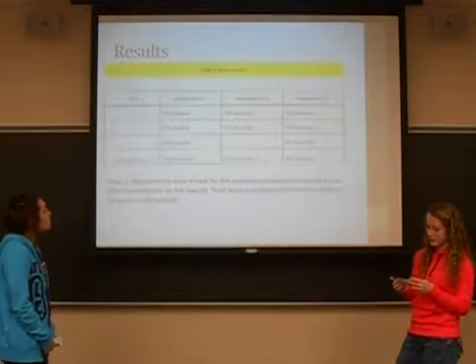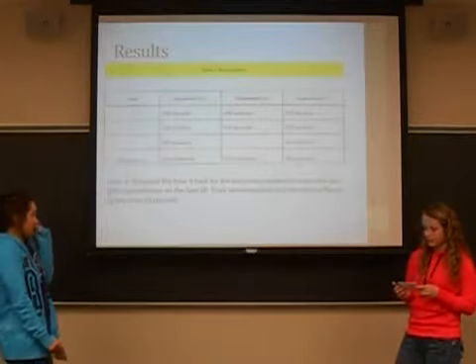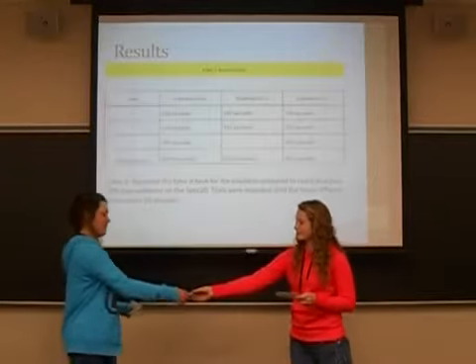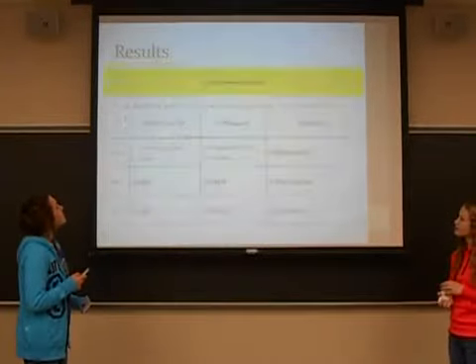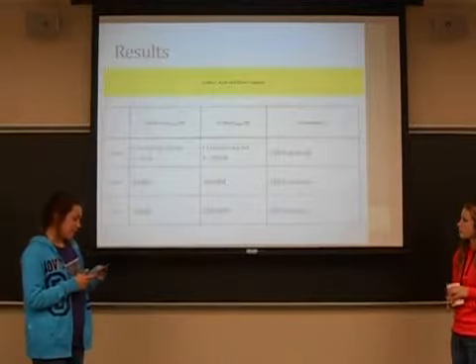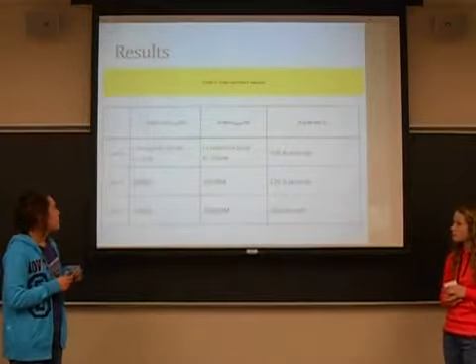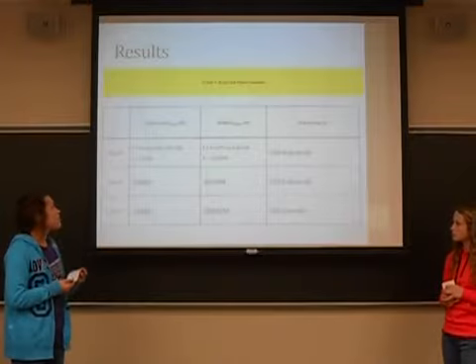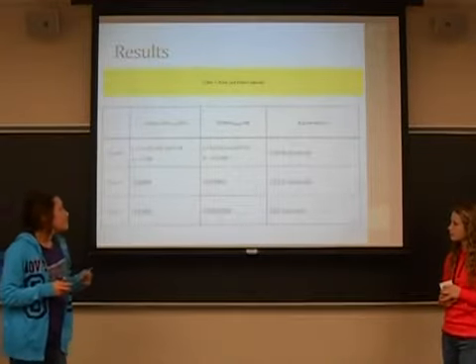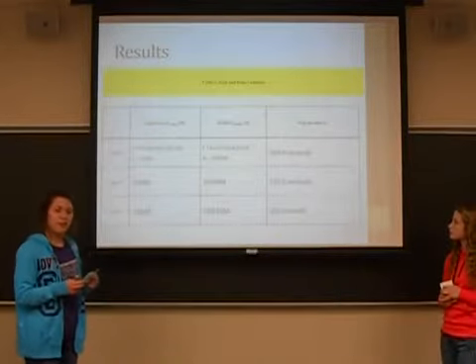This is table 2, which was our reaction time. It recorded the time it took for the solutions prepared to reach and pass 30% on the Spec 20. The trials were repeated until the times differed by less than 10 seconds. This is table 3, the rate and rate constant. To find the molarity of the oxalic acid and the KMnO4, we use the equation M1 times V1 equals M2 times V2. So for experiment 1, 0.755 molarity and 5 milliliters and 12 milliliters were all given. So we just used that equation to find that it was 0.315. And then for the average reaction time, we just added up all of the reaction times from each trial and found the average time.